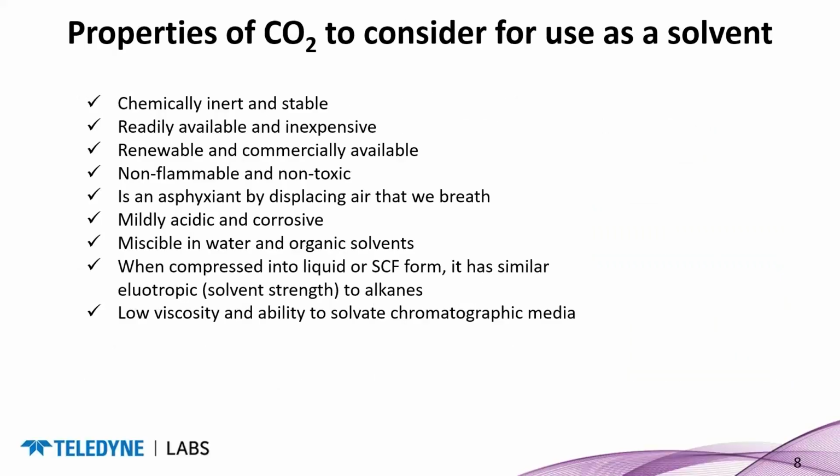So let's think again about CO2. If we were to use it as a solvent in this SFC mode, what makes it attractive as a mobile phase solvent? There are fortunately a lot of great features about carbon dioxide that make it a great solvent. It's chemically inert and stable.